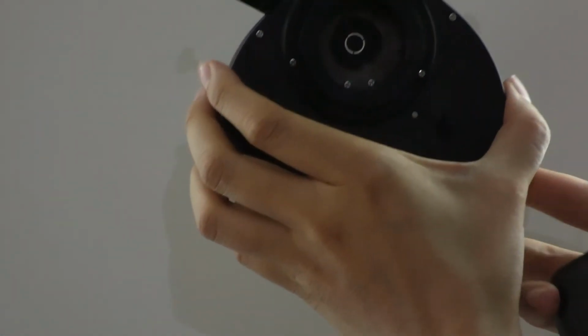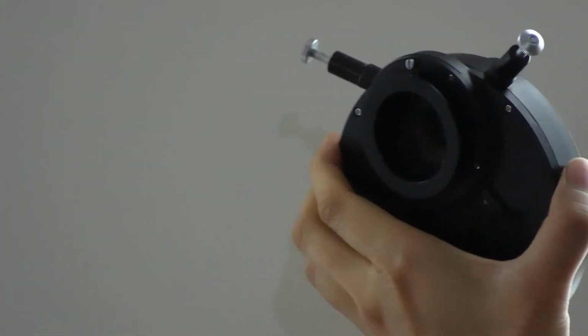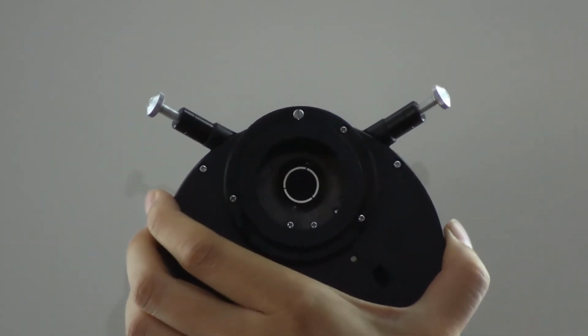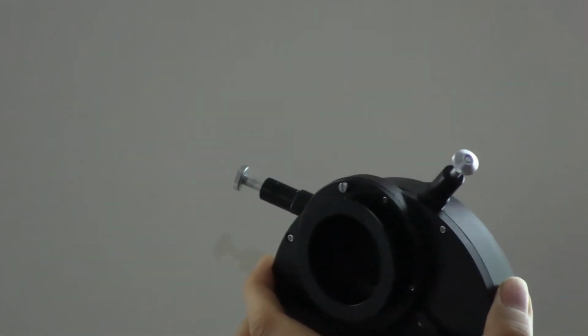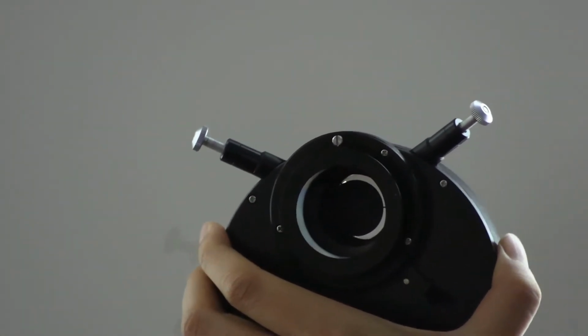Now it goes to the phase 2. And phase 2 shows a little bit larger. You can see the ring. And they also have another size, phase 3, the largest one. When you continue to turn this, you can also see there's a board for the dark field.